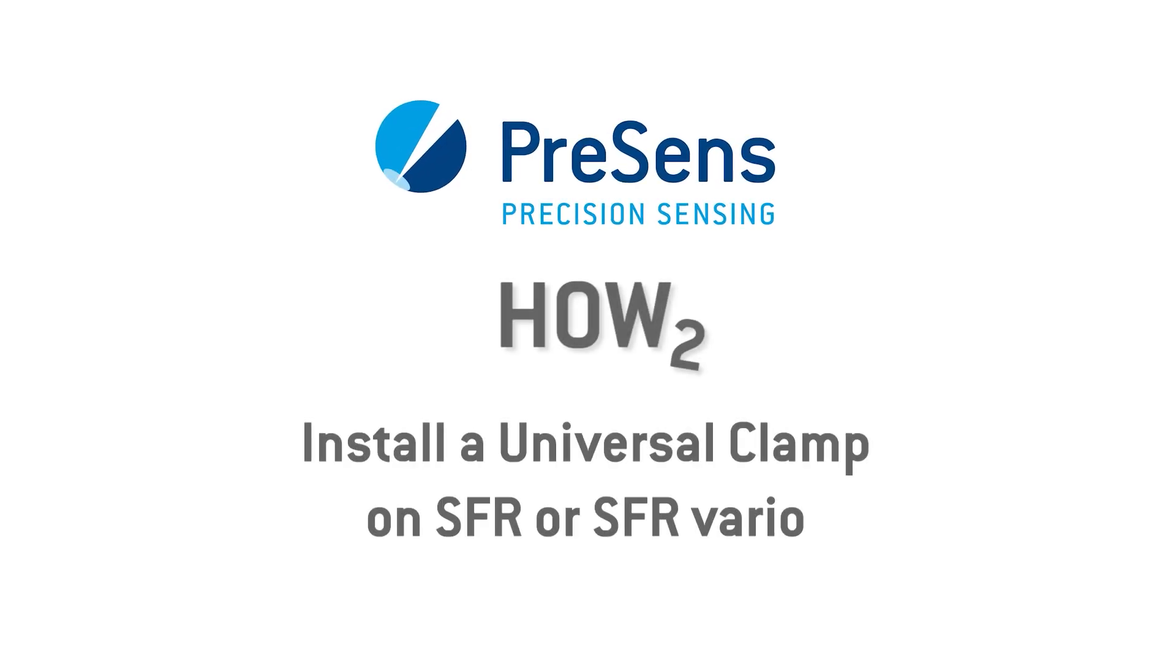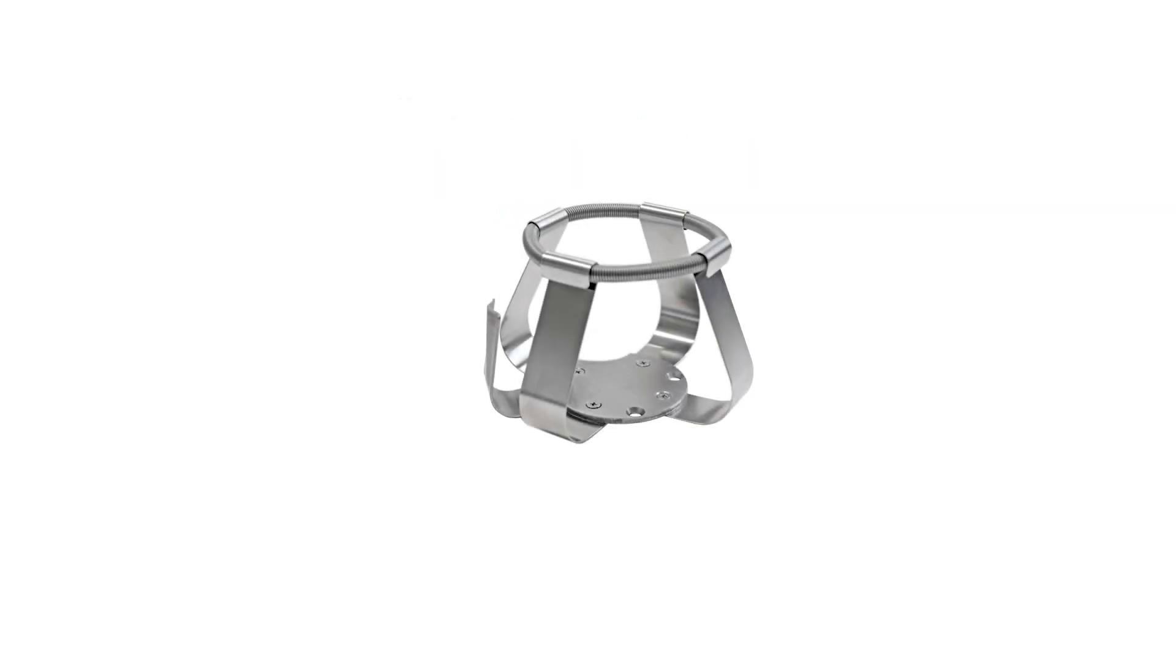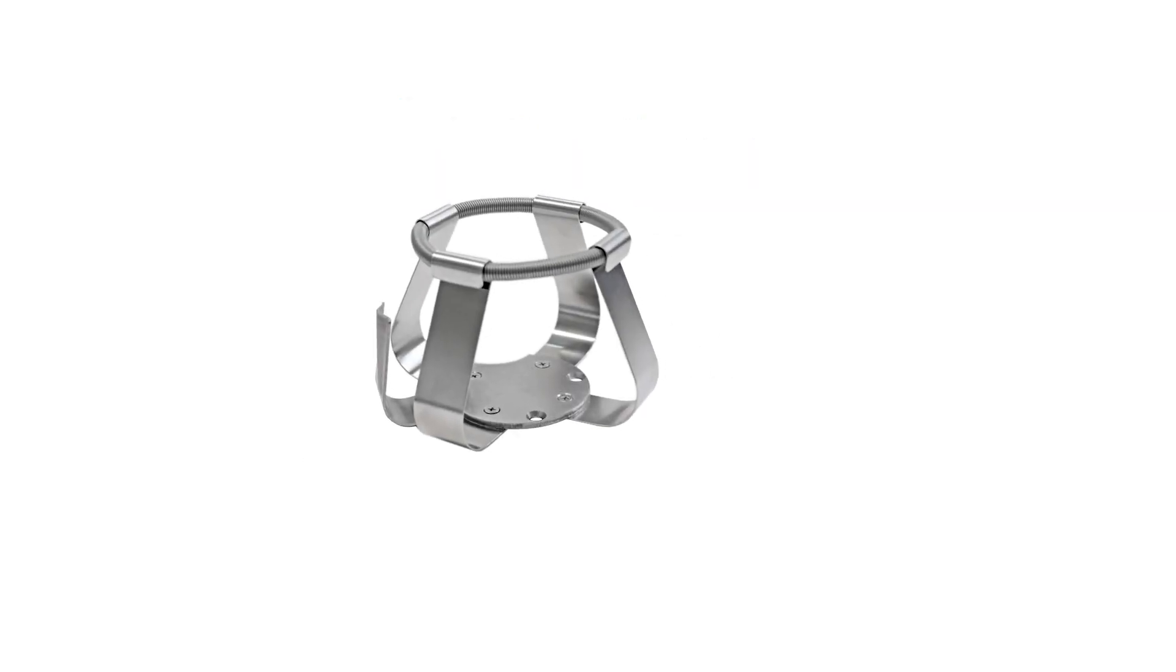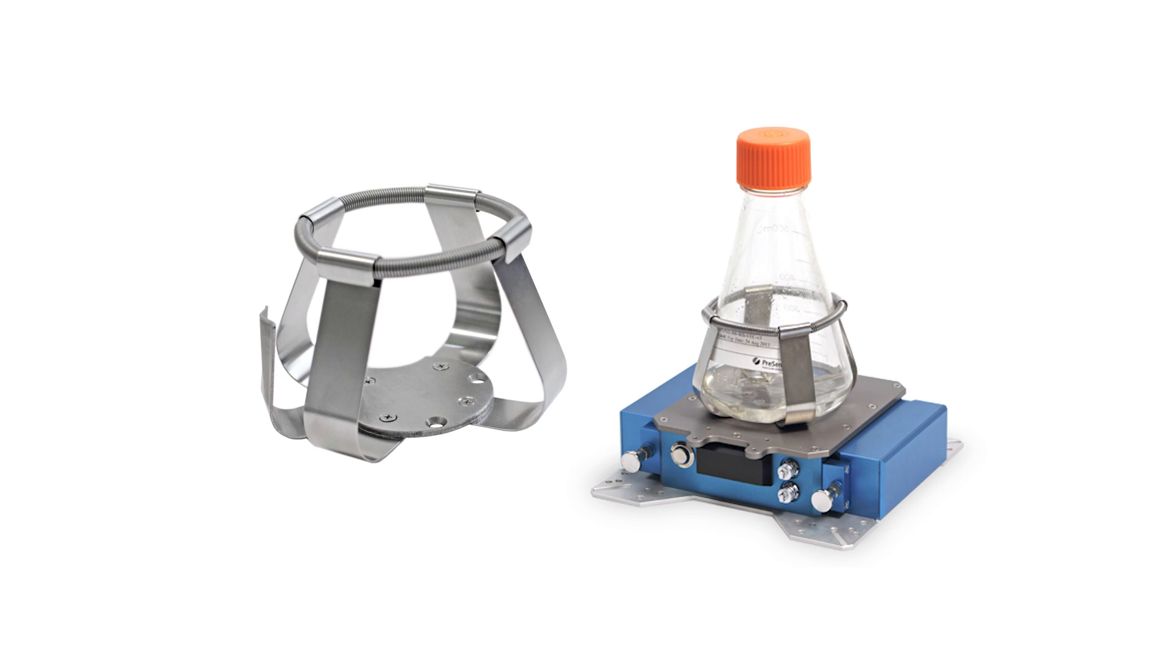In this video we show how to install universal clamps on your SFR or SFR Vario. The universal clamp is necessary to align the sensor spot inside the shake flasks above the optics of the sensor flask reader.